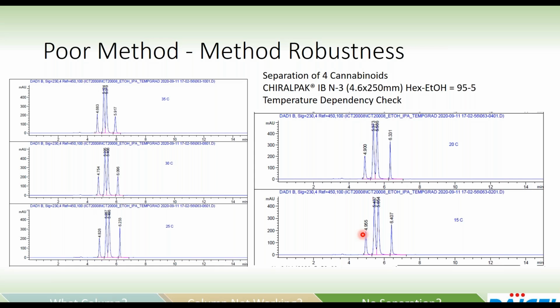And you can see for the most part, other than slightly longer retention at the lower temperatures, which is expected, there isn't a dramatic change overall in the selectivity. Certainly there isn't in elution order or anything else related to the performance of the chromatography.